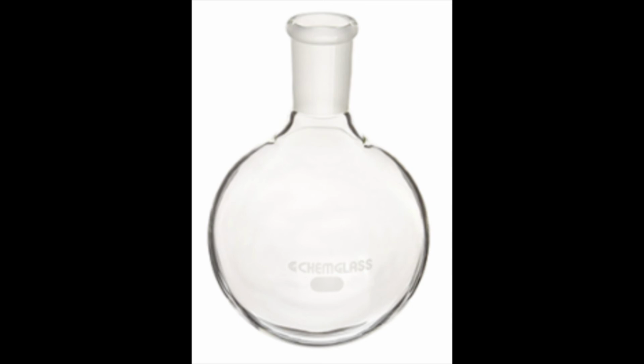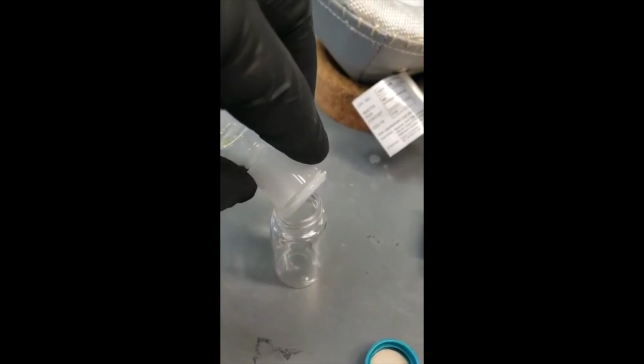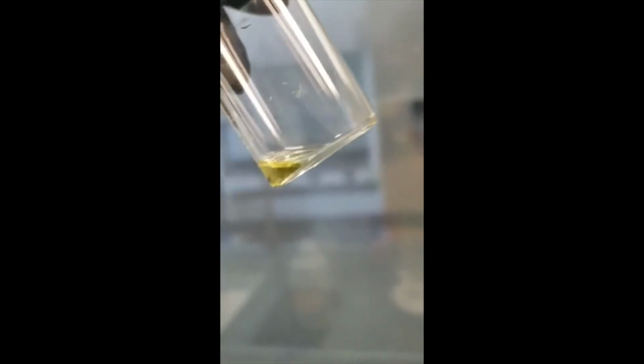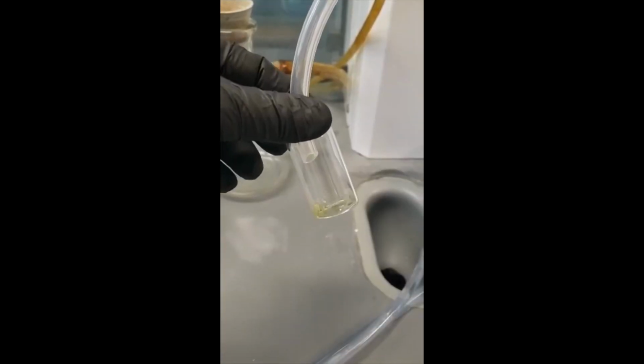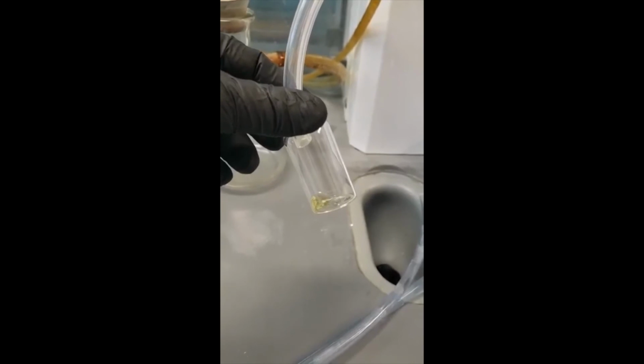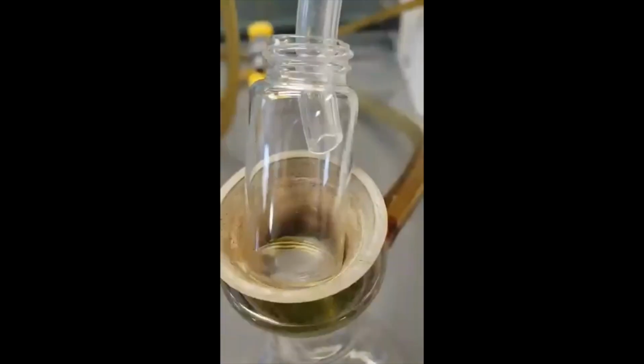However, if you cannot actually see any oil in your round bottom, then add 2 milliliters of methylene chloride back to your round bottom. Swirl it around, get that methylene chloride to get all of your oil out, and then transfer that 2 milliliters from the round bottom into a small glass vial, and we will then dry it using air. This is just a way of concentrating our oil so that we can see it. Once the methylene chloride is all evaporated off, you'll be able to see your oil in your vial.